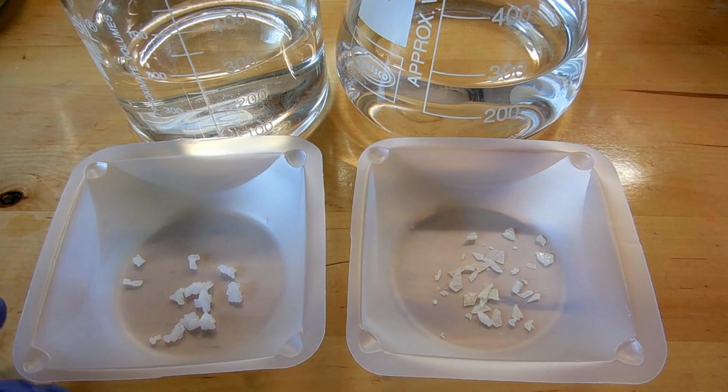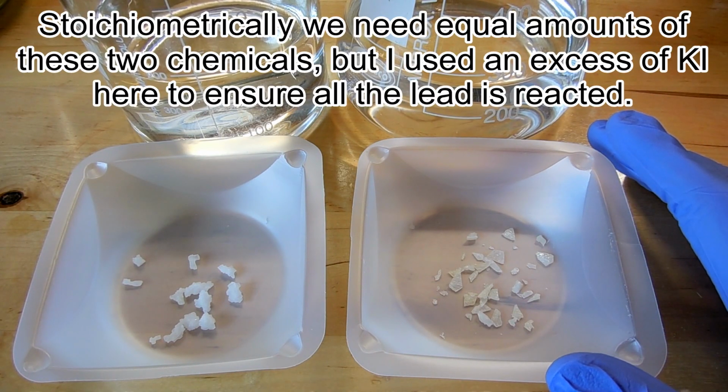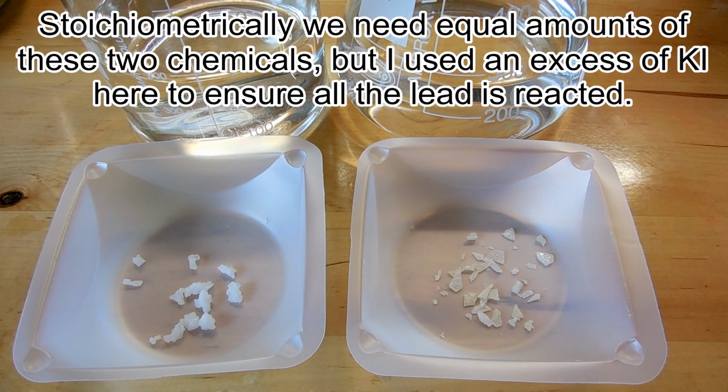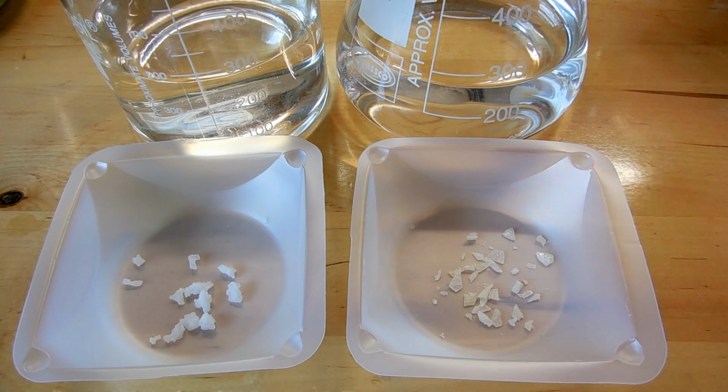So for this demo, we've got 1 gram of potassium iodide on the left, 0.8 grams of lead nitrate on the right, and the lead nitrate I made myself from dissolving lead metal in nitric acid. And we're going to be dissolving these into solutions of 250 milliliters each, so 250 in the flask, 250 in the beaker. So let's go ahead and do that.